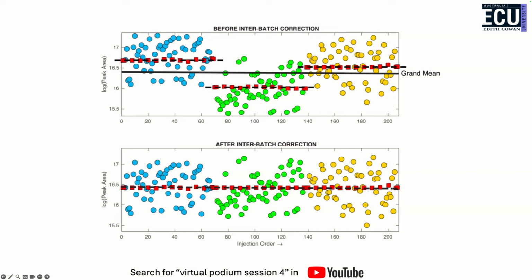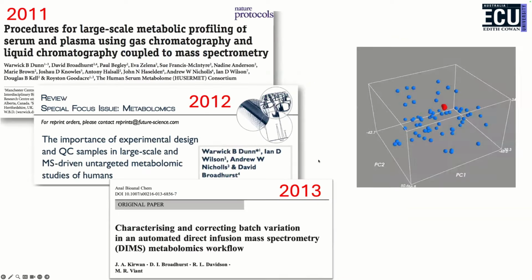This is a very simplified overview of this whole process. If anybody's interested in a bit more of the maths and a bit more of a critical assessment of this whole process, if you go to YouTube and put this search term in, the first lecture that comes out is one that I gave about 3 years ago, which talks a bit more about the complexity of this sort of approach, but I don't really have time to go into that right now.